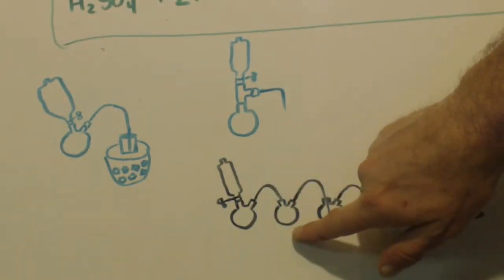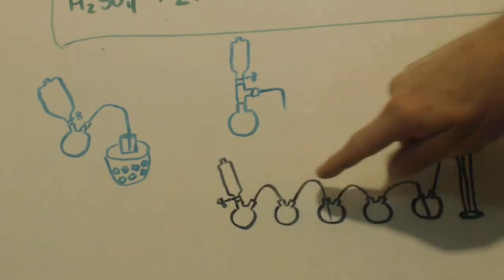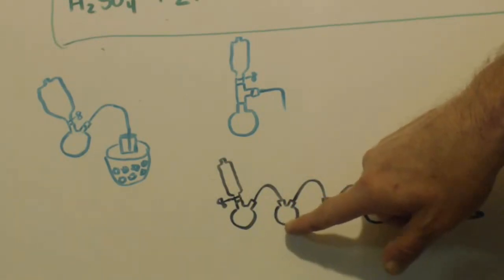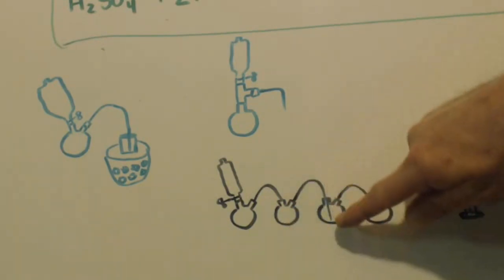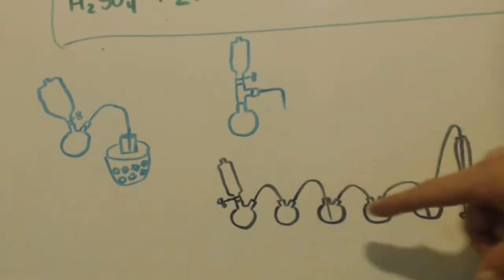And the reason why is in case. So basically, this is just a hose going to here, because this is just an open apparatus. Think of this as a thick part of the hose. It comes into here. This is where you have your water, your 100 milliliters. That's what I'm working with.